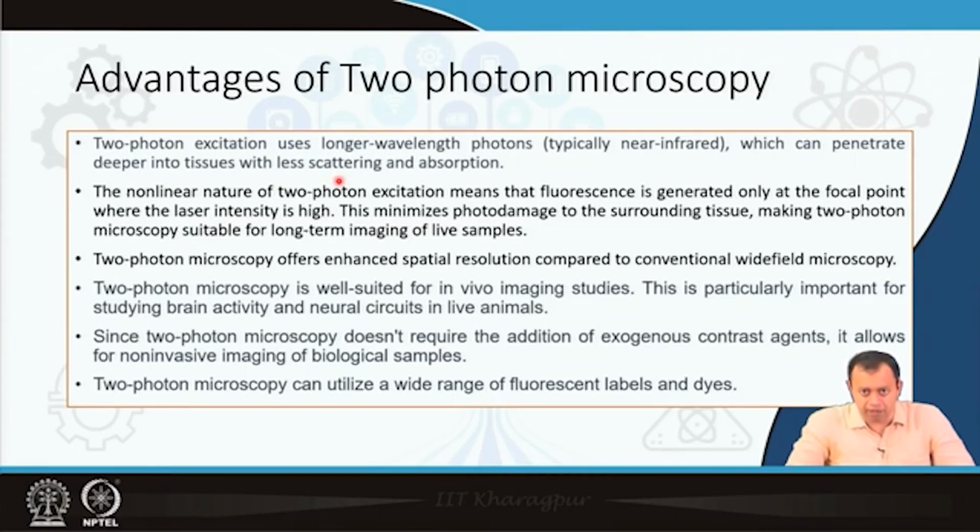It is only absorbed by the fluorophore which is being made to tag with the calcium ions. Calcium ions being just an example. It can be made to tag, to label, to connect with other areas as well. But overall this is the idea of 2 photon microscopy.